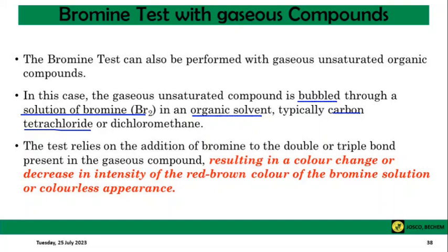Like we've said initially, the principle would remain the same based on the fact that addition of bromine to the double and triple bond gives us decolorization or a color change. From which color? Red, brown, or brownish red to a colorless appearance, or from a deeper color to a lighter color.